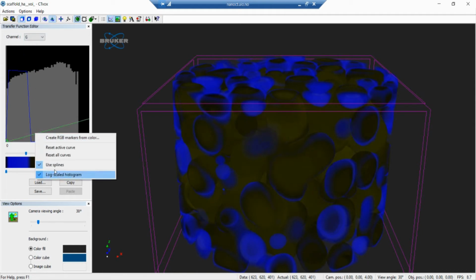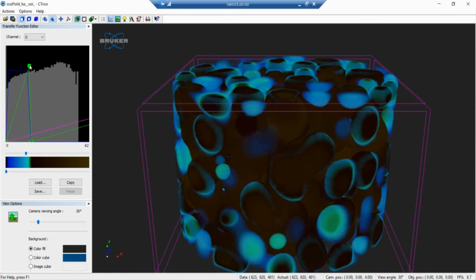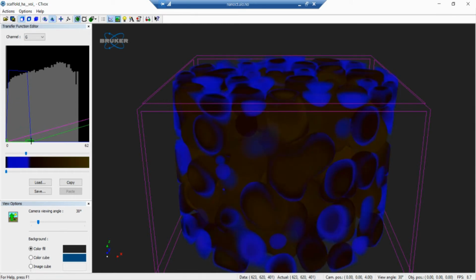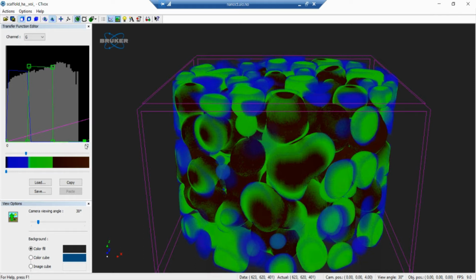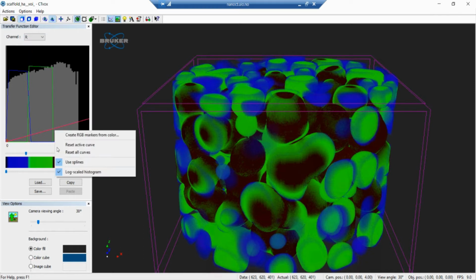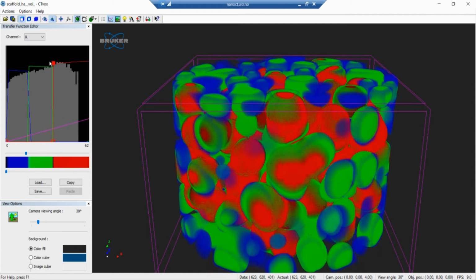For the green one, I'm going to drop everything here, like this, and the red one. Okay, more or less like this.